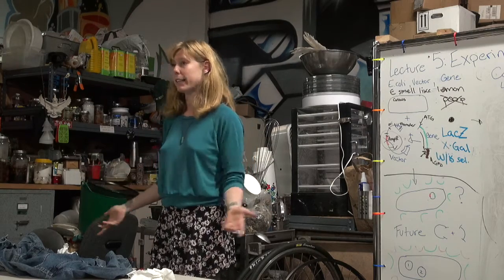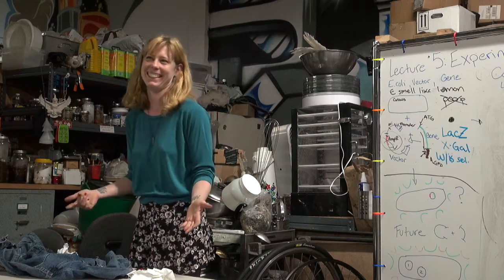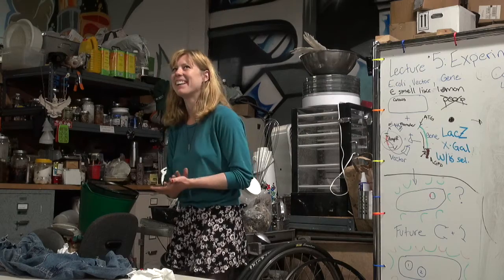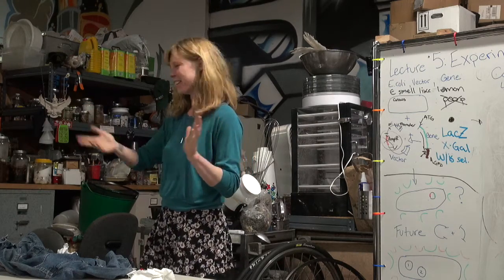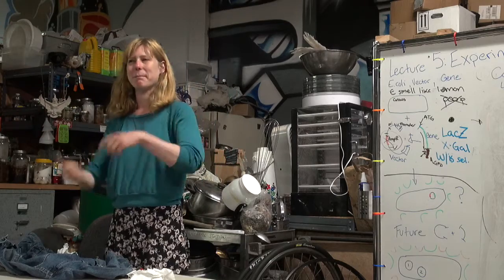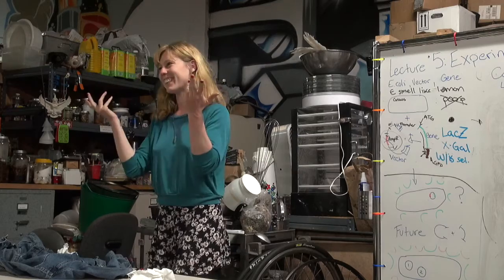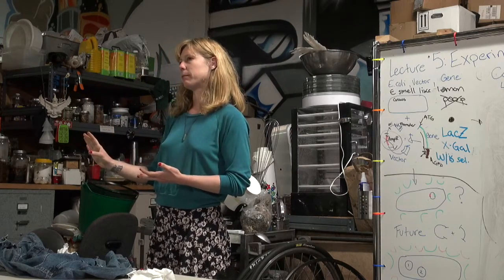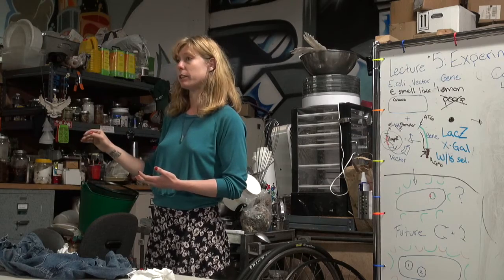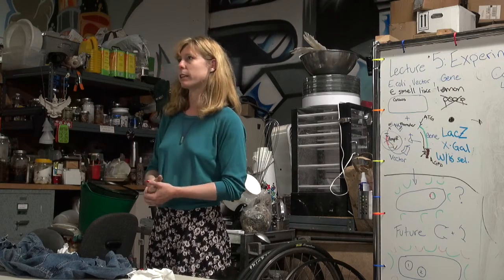Well, everybody got plasmid. I'm thinking that at least a third of the class either had no experience or were just mixing things up because it sounded like fun, even though I didn't tell you to, right? Hey, that's still okay. Everybody got plasmid. There were different amounts of plasmid in each yield, but there's issues with the pipettes as well. So there's some things going on there.